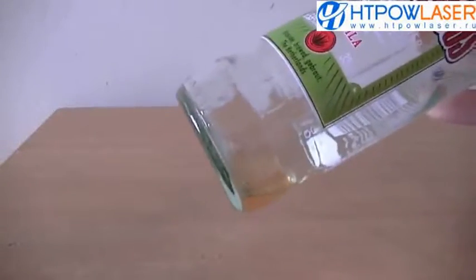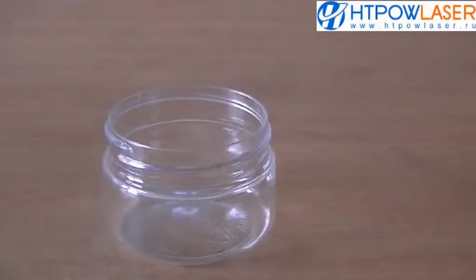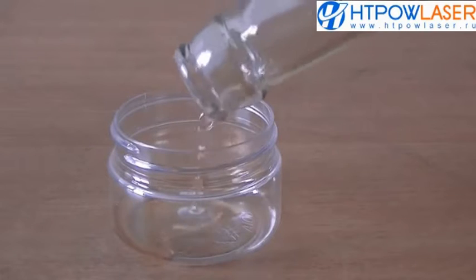We need a sample of liquid crammed with bacteria. This nearly empty bottle of beer has been lying around on the window for days, and it should provide a pretty good sample of bacteria.